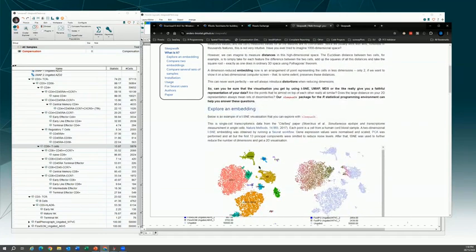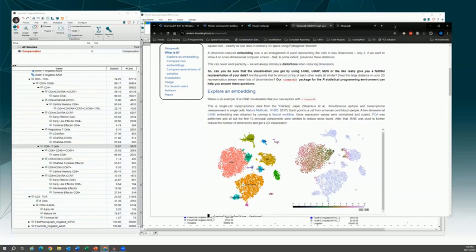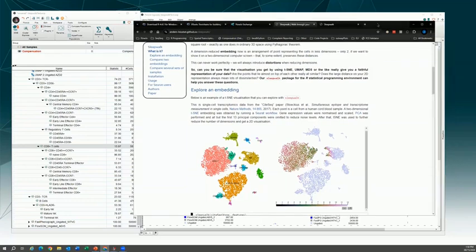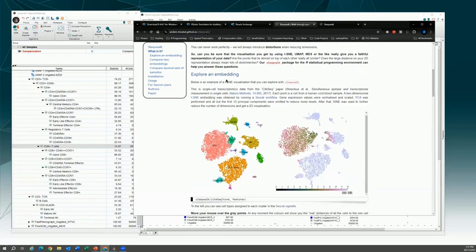Some people might want to go and draw a gate on an embedding, but as you might know or suspect, how do you really know if an embedding faithfully represents the high dimensional data in low dimensional space? Because it's trying to do a lot and embed all that information in just those 2 dimensions. And so with Sleepwalk, we can look at that information in this way.